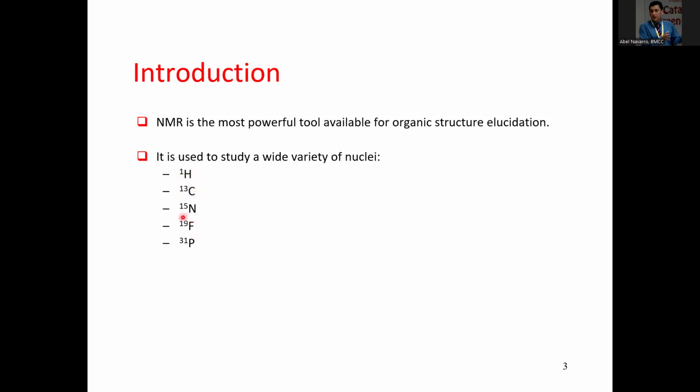Nitrogen NMR is commonly used by biochemists and biophysicists, because proteins and amino acids contain nitrogen inside. So we want to explore the nitrogen. Now, fluorine for dentists, right? You want to investigate any corrosion, any enamel protection, or let's say cements or resins, the durability of some resins or new polymers that you're creating. You want to know how well they protect the, I think it's called hydroxyapatite, something like that. It's the mineral that is in your teeth, right? And then phosphorus we find in DNA.